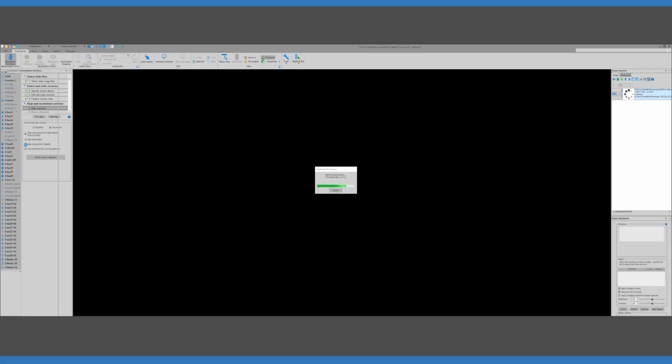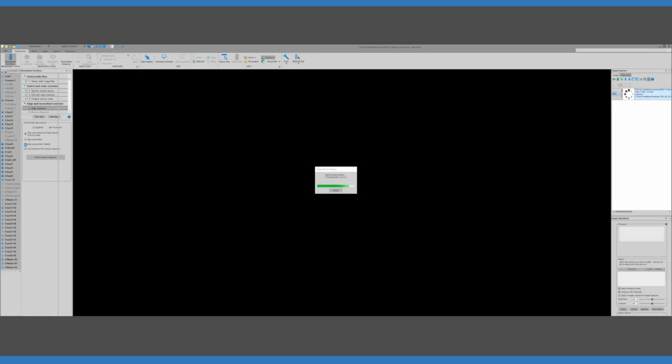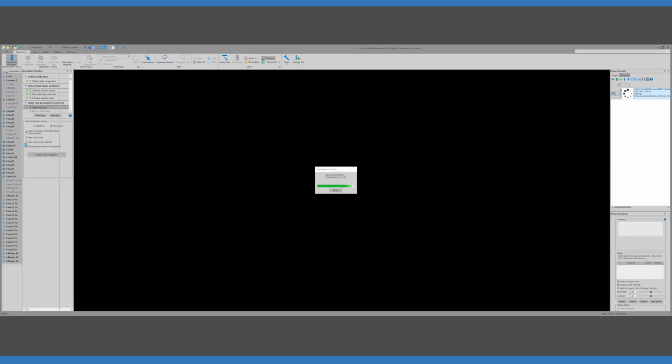But this is a really good option if the intersection spacing is very large, or there's a lot of tissue damage. In that case, it can be good to just go to the next step where we do interactive alignment. You can initialize the alignment of each section interactively, and then run some automatic registration to improve the alignment. And we'll be moving to that step very shortly.